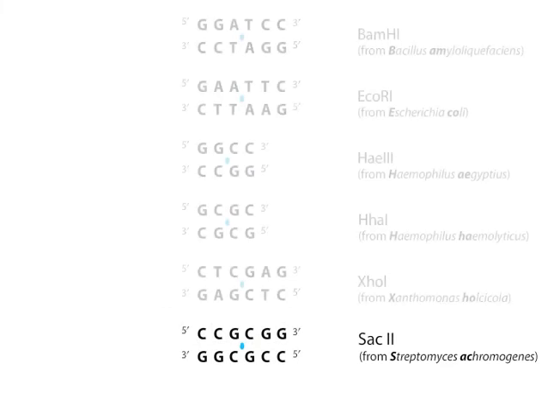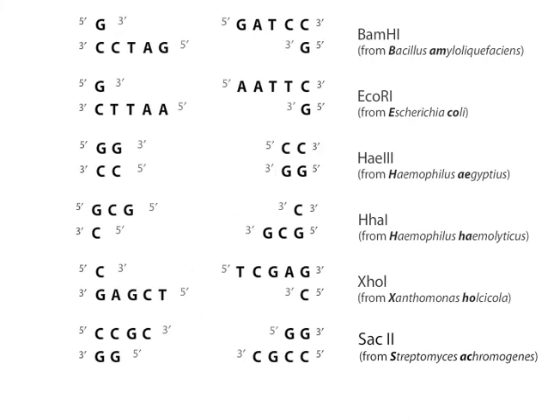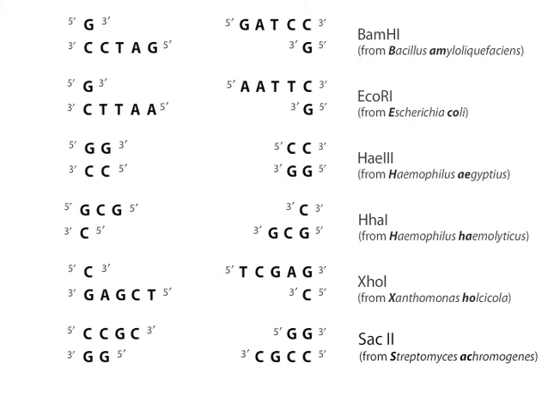Restriction enzymes have been purified from a wide variety of prokaryotes, where their biological role is to cleave foreign DNA molecules, providing them with a primitive immune system. Restriction enzymes are indispensable for a variety of laboratory techniques.